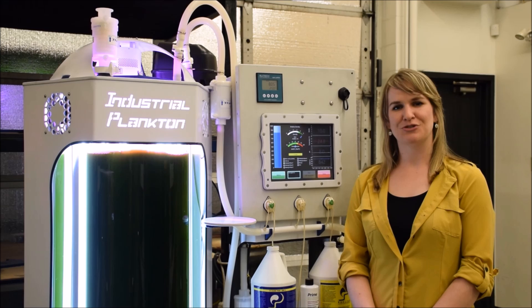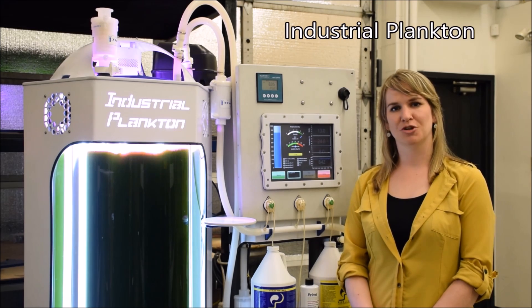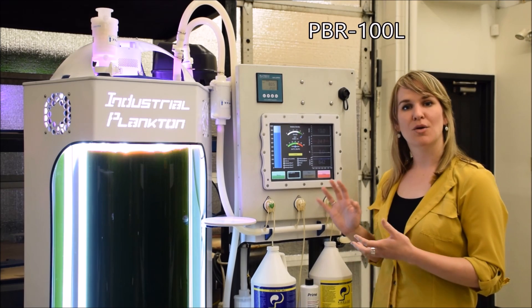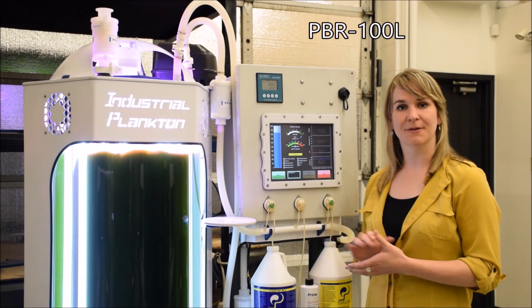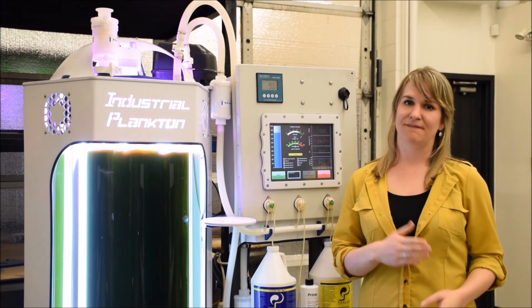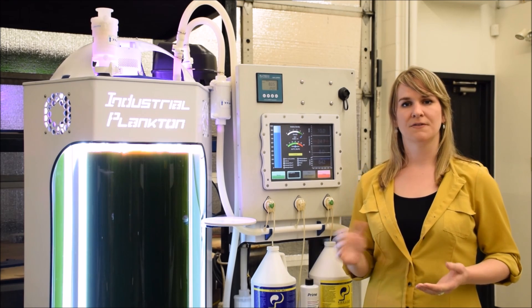My name is Ashley Ralston, Director of Sales and Marketing at Industrial Plankton. Today we're going to be taking a look at the PBR100L LG Bioreactor. This unit produces algae which can then be used as live feed for aquatic animals or for research purposes.